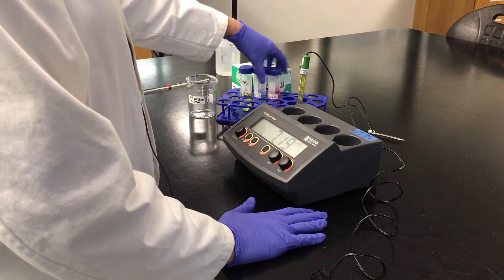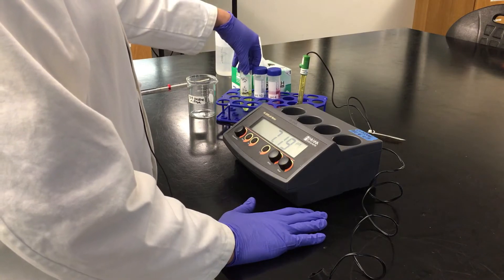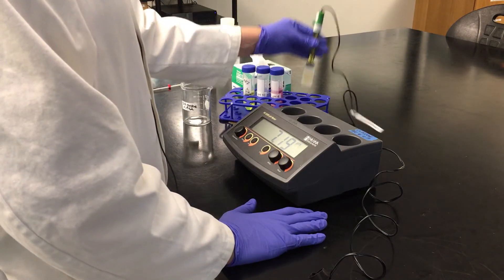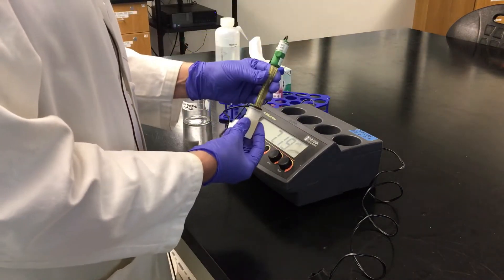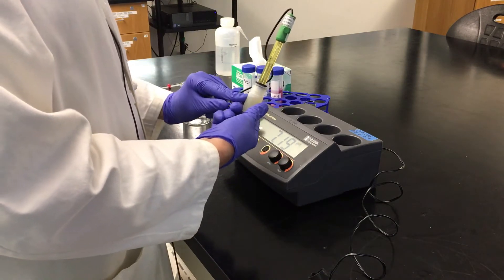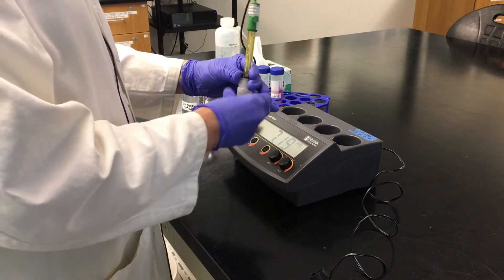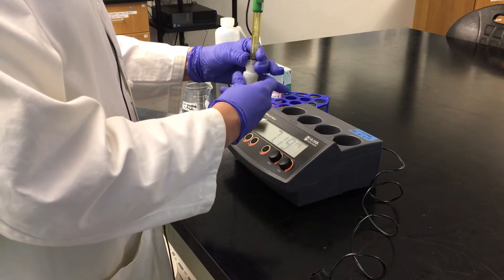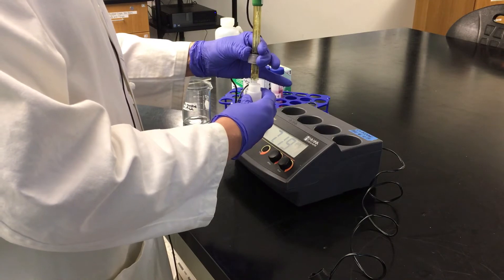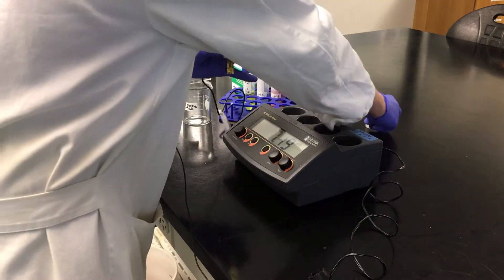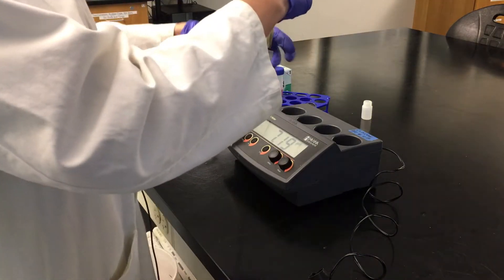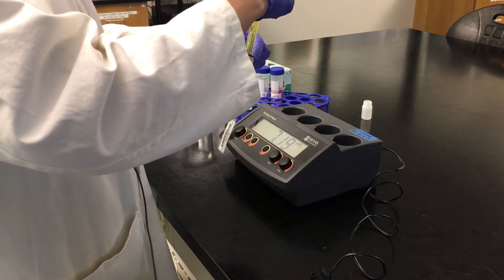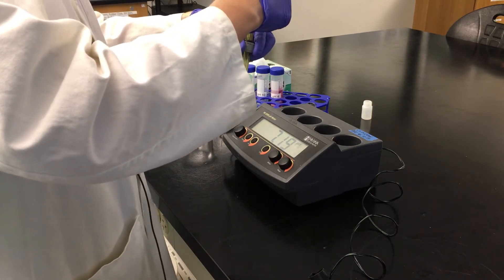Here we have a pH 4, a 10, and a 7. The first thing we need to do is remove the storage solution from the bottom. So to do that, just carefully unscrew the bottle and set it aside. The cap can then easily be slid up and out of the way.